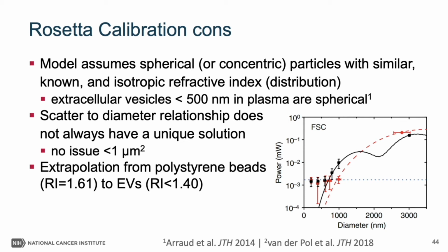The last disadvantage is that the current approach requires an extrapolation from the measurement of bright reference particles to dim EVs, which may affect the accuracy. This last problem emphasizes the need of reference materials with scattering properties similar to biological particles, which brings me to my final slide.